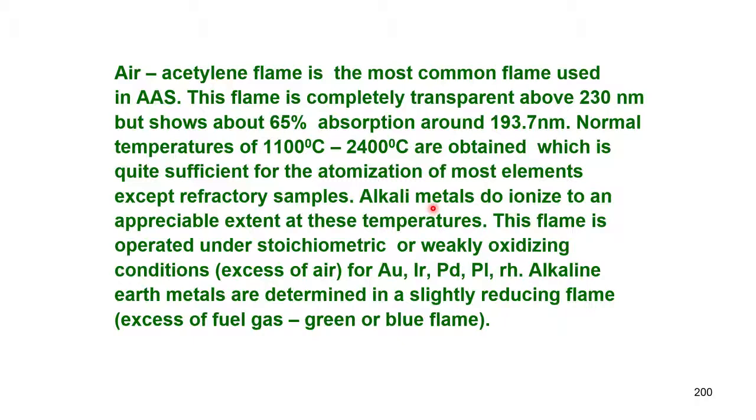Many people do not do the determination of these elements because they ionize and the absorption signal is smaller than emission signal. So, this flame is operated under stoichiometric or weakly oxidizing conditions, that is at slightly lower height and excess of air.